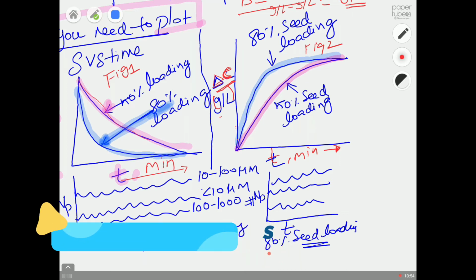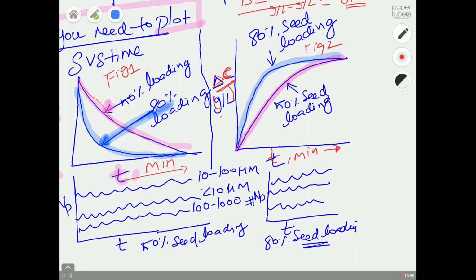So what does this graph mean? At this end point, which is somewhere around here, that will be the maximum amount of mass that you can crystallize in 1 liter of your solvent. So this gives a rough idea about that. If you see this line, let's change to the pink highlighter, this one gradually increases with respect to time, which is okay.